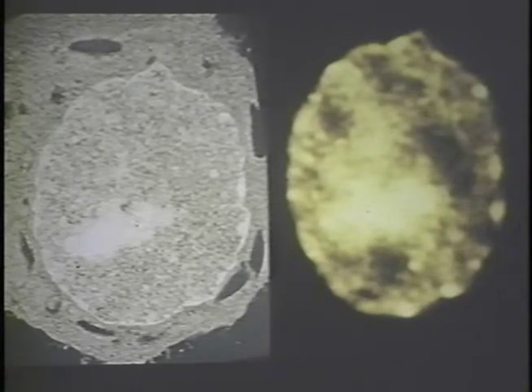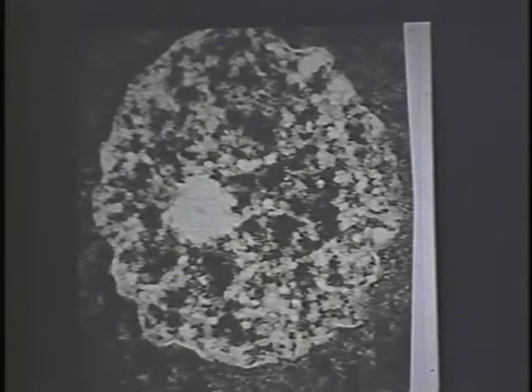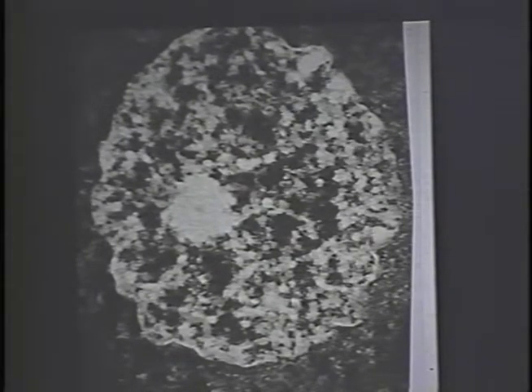And what this convinced us of was some of the fundamental problems in doing imaging like this because of the lack of a DNA-specific stain for the EM. Much of what was going on here was actually being covered up by the lack of such a stain. And so we developed techniques to do very gentle extraction of the same cells, where we could compare and contrast living material using the light microscope, fixed material using the light microscope, and extracted material using the light microscope, all to verify that at least at the level of resolution of the light microscope, there had been no distortions in the chromatin.